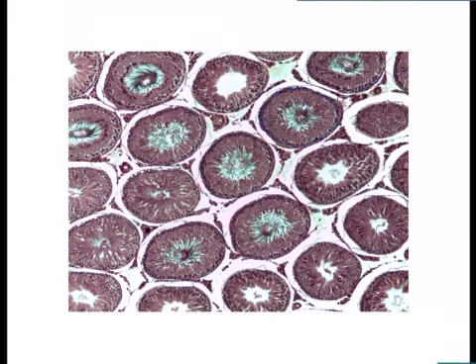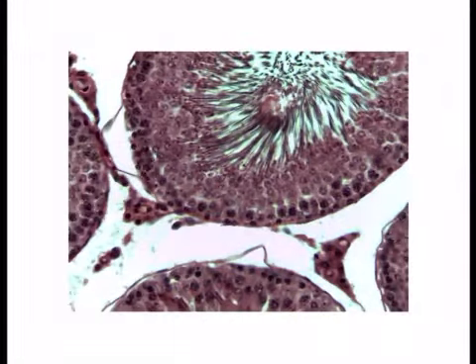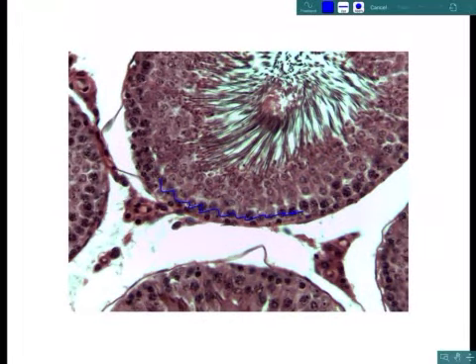And then you do have, I'm going to get a little bit closer up. So these are all the stem cells right here. They're called spermatogonia. Now we can see some other cells that are through here. This is all the sperm. These sperm cells are actually called spermatocytes. They're going through meiosis 1 and meiosis 2. Remember, the purpose of going through meiosis 1 and meiosis 2 is to reduce the chromosome number to 23 chromosomes and no pairs, a haploid, right? And so you can see here, this meiosis 1 and then meiosis 2 would be occurring here.